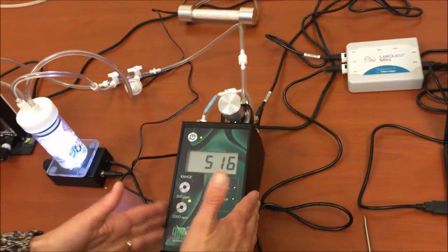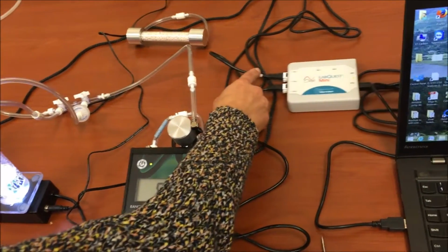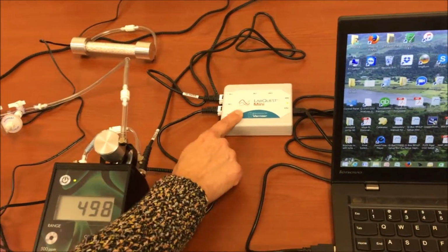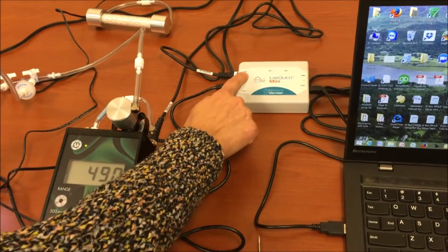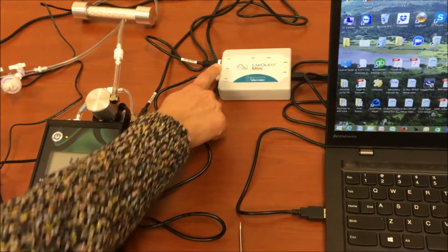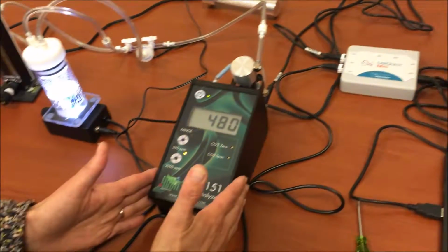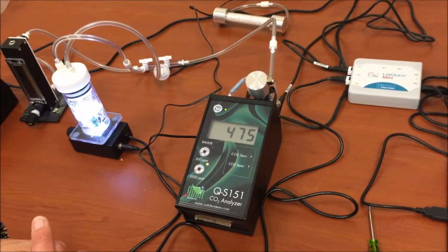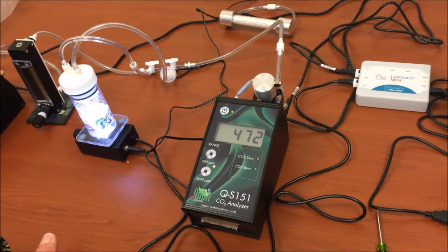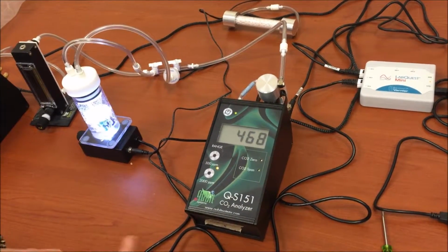The signals from the CO2 analyzer and from the LED light source, analog signals, go into our LabQuest Mini, which is our data interface. The CO2 analyzer is in channel 1, the light source is in channel 2. To start the experiment, the CO2 analyzer should be calibrated first. It should be turned on well ahead of time so it can warm up. I'm not going to go through the calibration here because that's explained in the manual. We will go straight to the software.